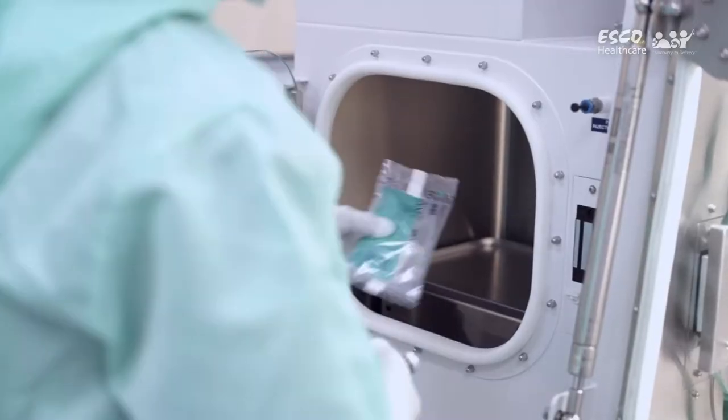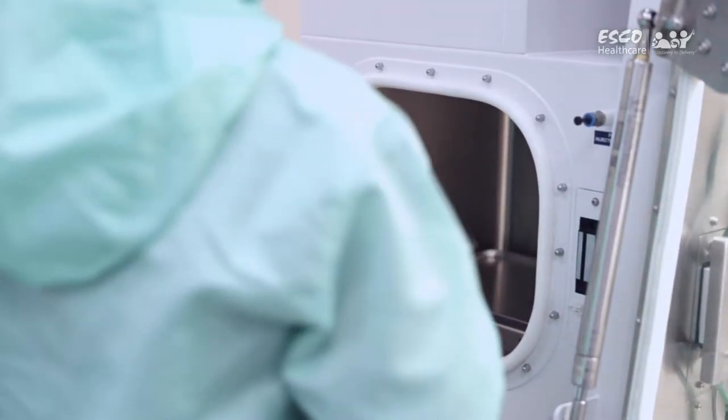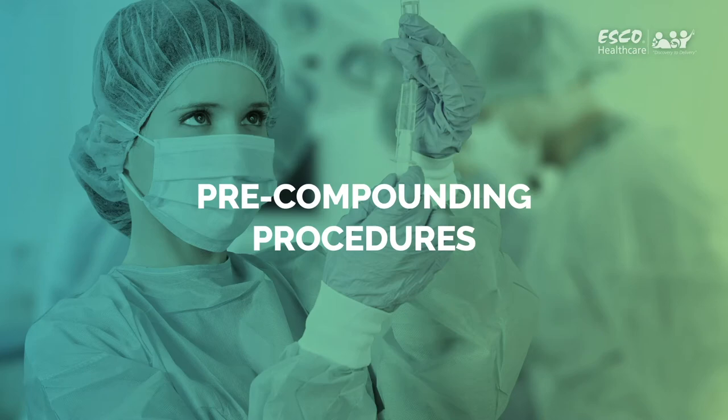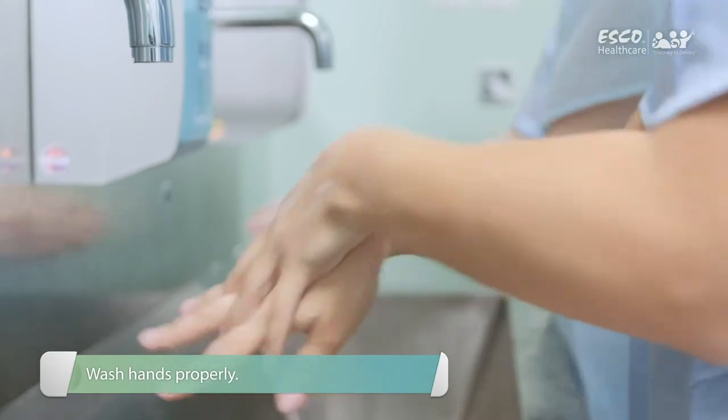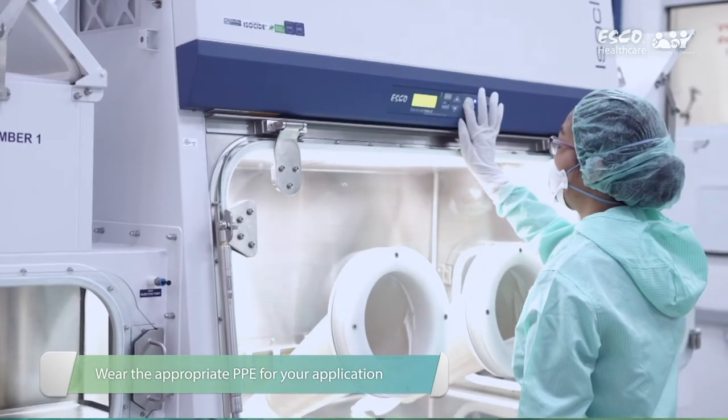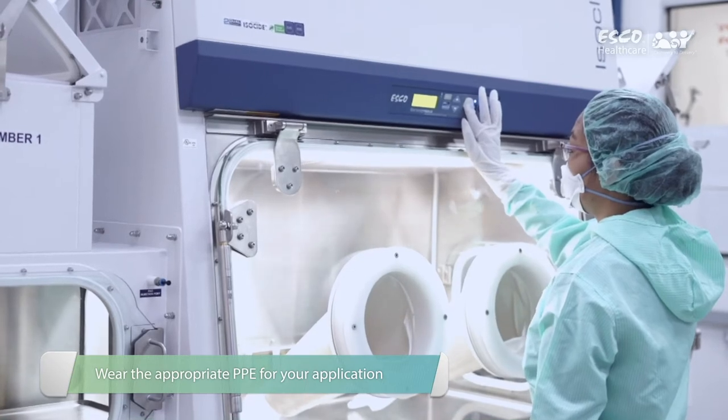Aseptic technique and strict adherence to SOPs are necessary to assure product and operator protection. Pre-compounding procedures: wash hands thoroughly before starting any work process. Wear proper PPE appropriate for your application prior to entering the room.